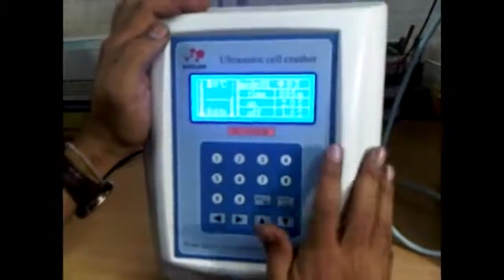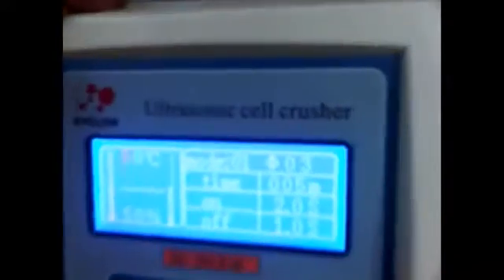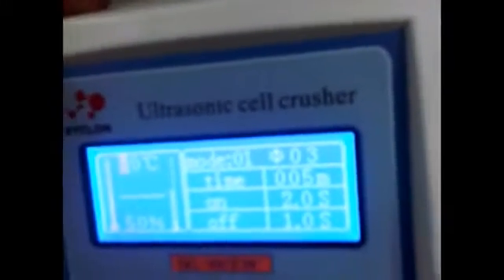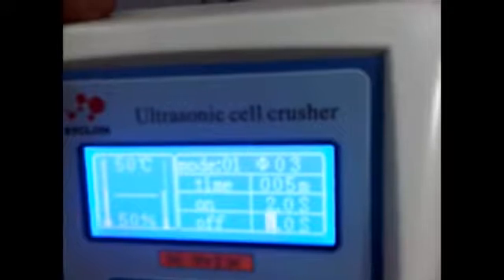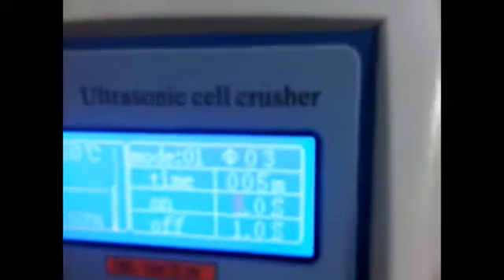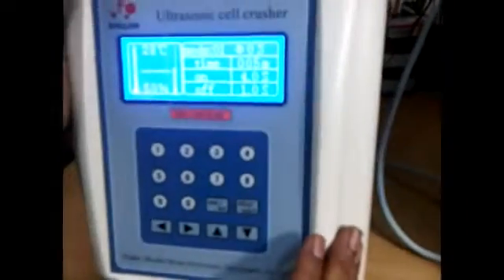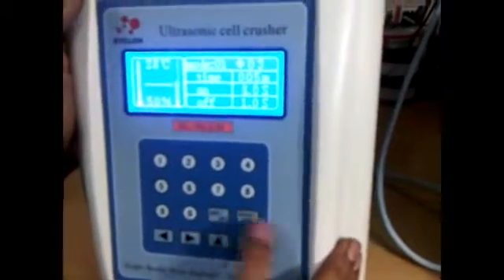So here we have set the parameters at program number one. The run time is 5 minutes, on cycle is 2 seconds. Let us increase to 4 seconds and here I will say set and it will store the parameters. So now we are ready to run and we can say start. Four seconds on, one off, and then again four seconds on.